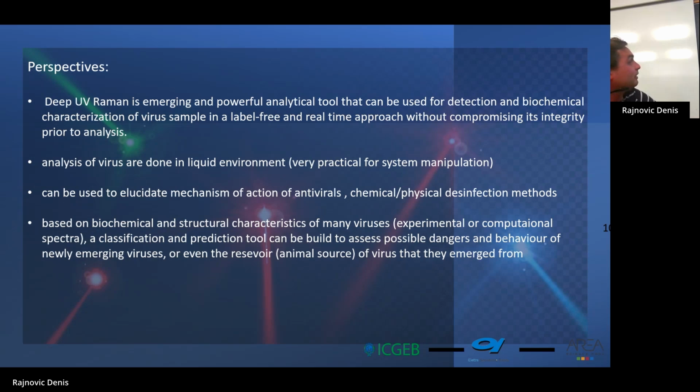Analysis of viruses is done in a liquid environment, which is very practical for system manipulation if you need to reduce the pH to see structural changes, or to introduce something to the system like drugs or antibiotics. We saw that it can be used to elucidate the mechanism of action of antivirals, and in this case, a physical disinfection method, and explain the mechanism of inactivation.